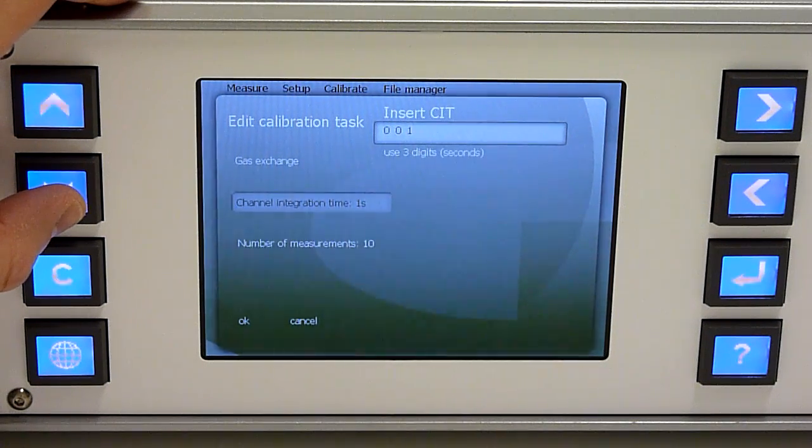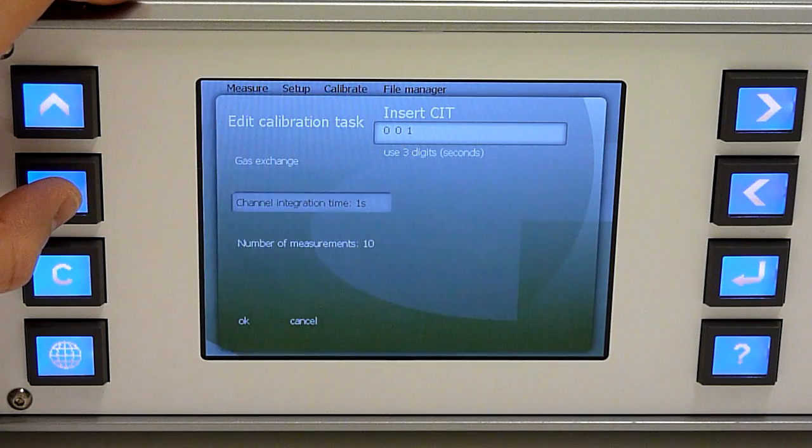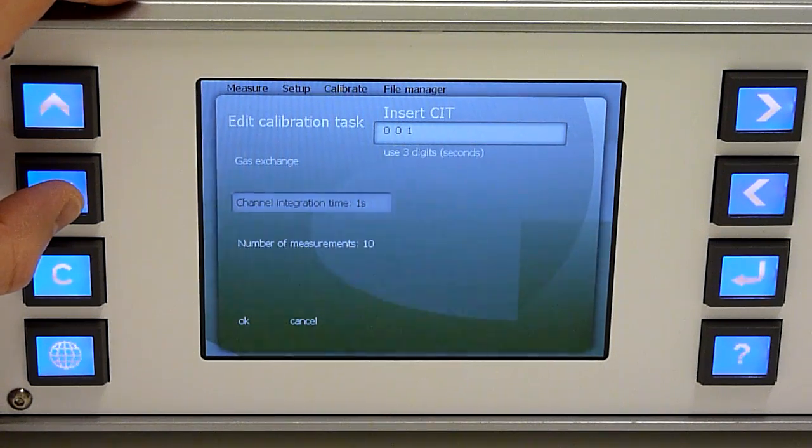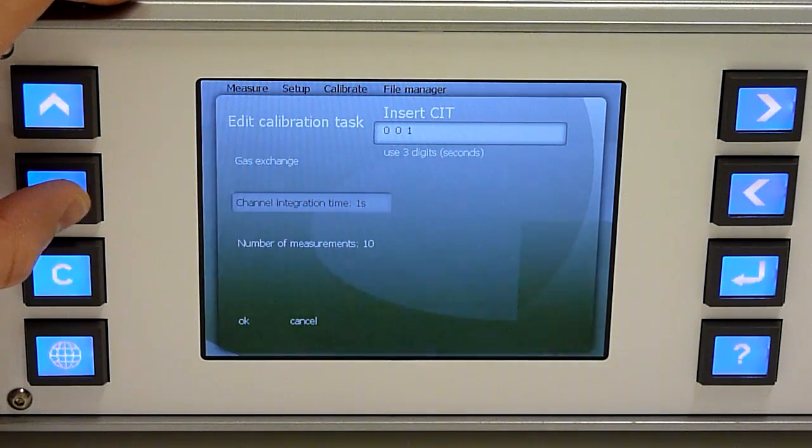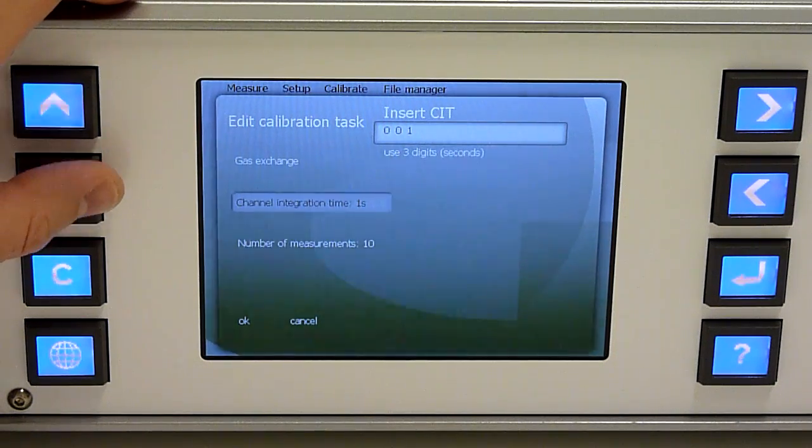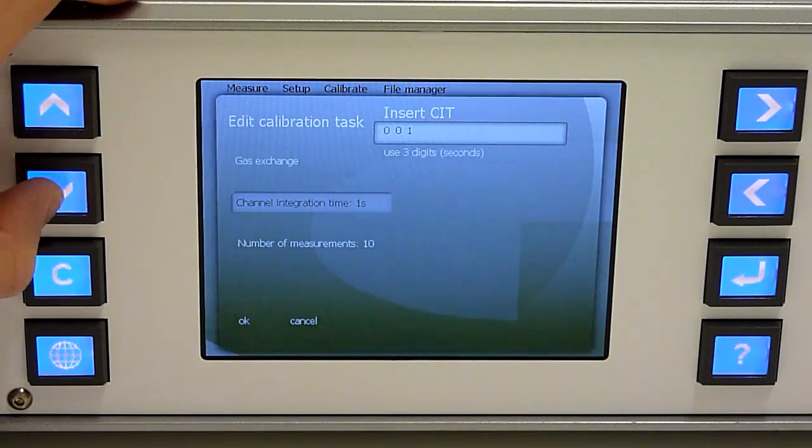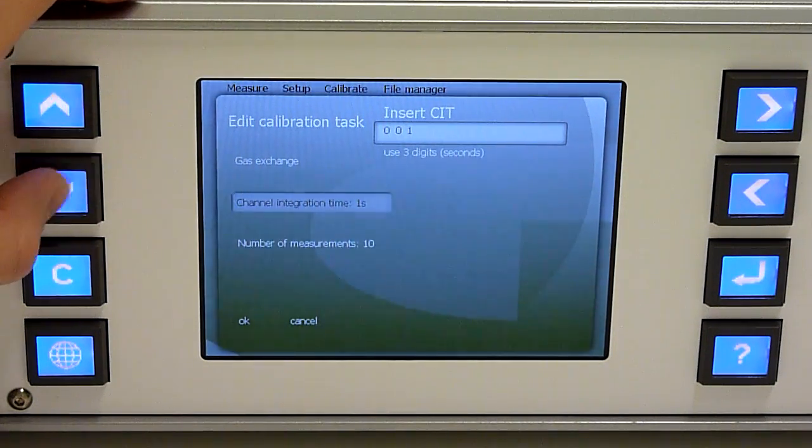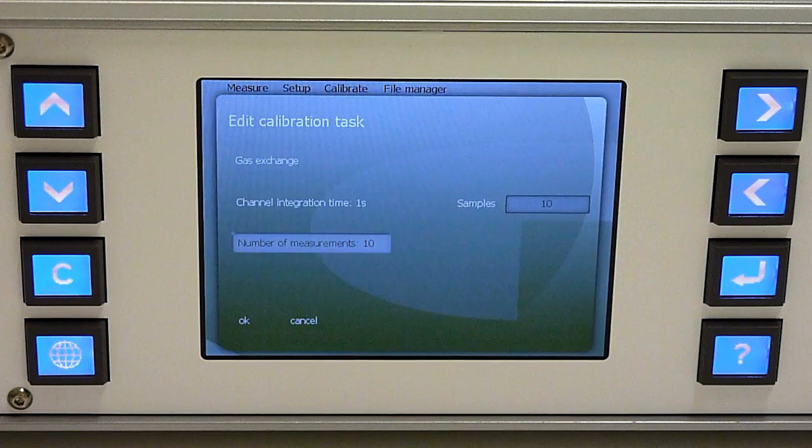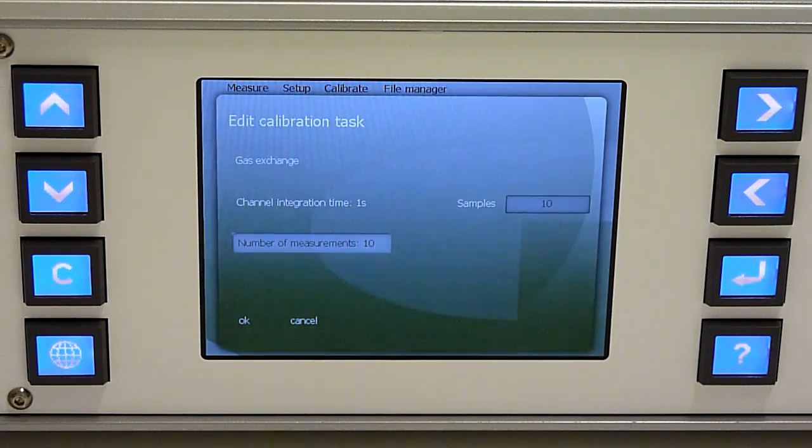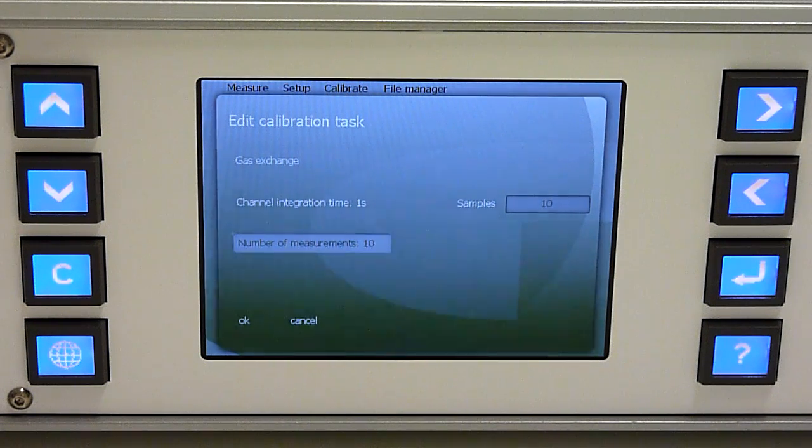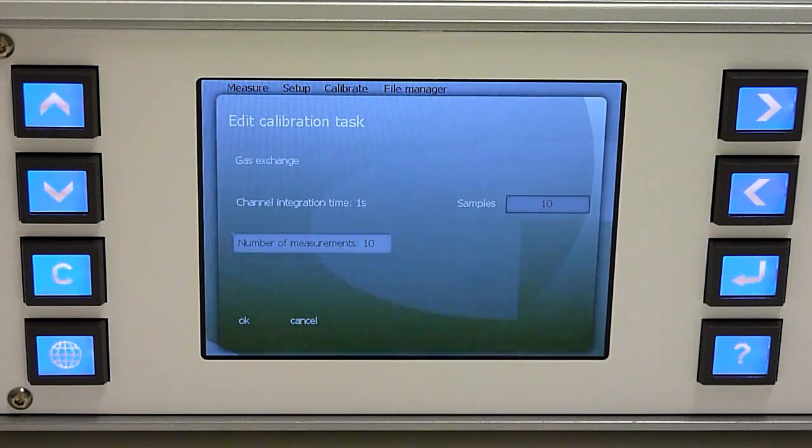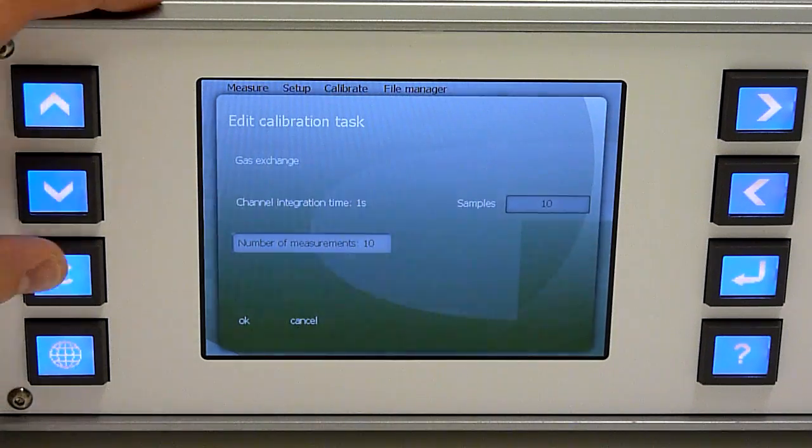You should use the same channel integration time as you use in the measurement, but if your channel integration time is different, the instrument will handle it anyway. And you can select the number of measurements that will be used when calculating the statistical calibration data.